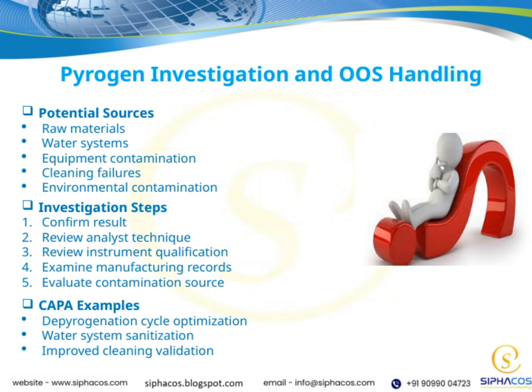When it comes to pyrogen investigation and handling out-of-specification results, we start by looking at potential sources. These include raw materials, water systems, equipment contamination, cleaning failures, and environmental factors. Our investigation follows clear steps. First, we confirm the result itself, then review the analyst's technique and the instrument's qualification. We also examine manufacturing records and evaluate where contamination might have come from. Finally, corrective actions might involve optimizing depyrogenation cycles, sanitizing water systems, or improving cleaning validation. It's a thorough process to keep things safe and compliant.